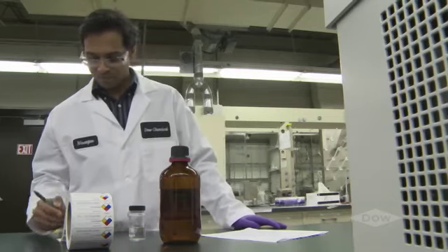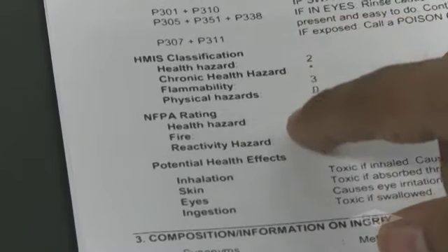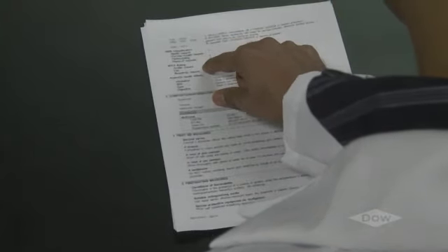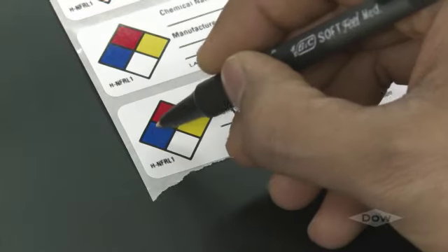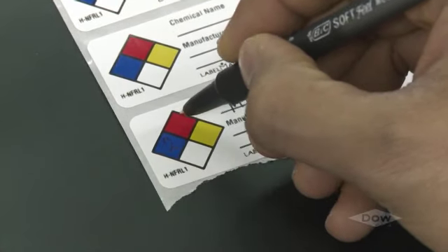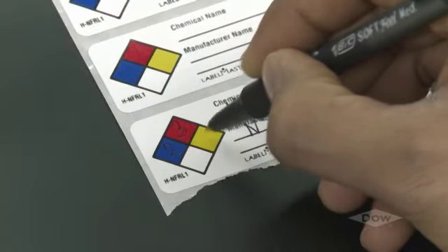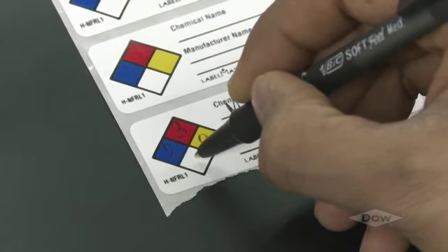He uses the great resources easily available to him. Material Safety Data Sheets, or MSDS, are an ideal place to start. Here NJ will find vital information like risk phrases or R phrases from the European Union, hazard phrases or H phrases from the Globally Harmonized System of classification and labeling of chemicals, the National Fire Protection Association or NFPA ratings, exposure controls for the material and any appropriate personal protective equipment or PPE required for handling.